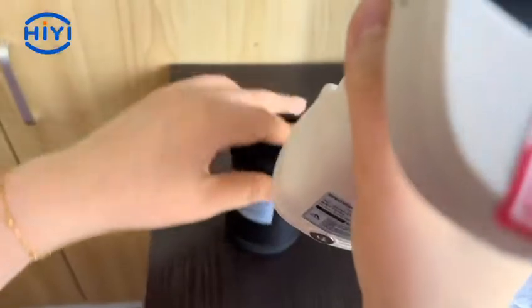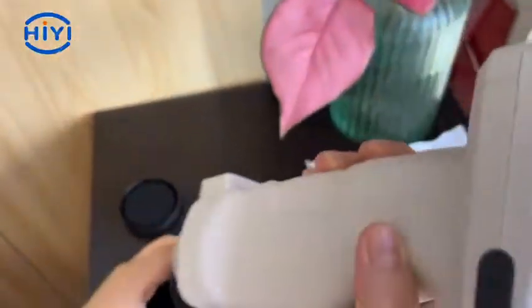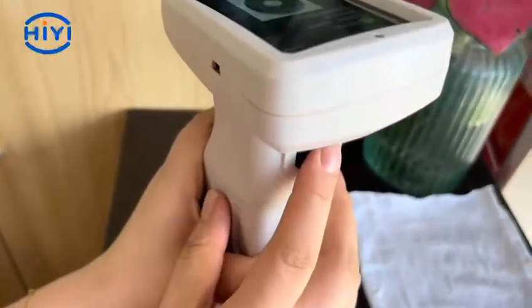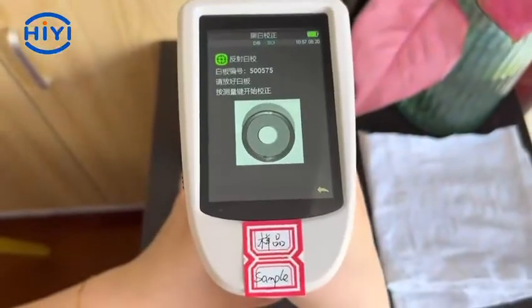Here is the black calibration. Now we will do the white calibration. Look at the serial number on the calibration plate — the serial number needs to be the same as the device. Press the black button.